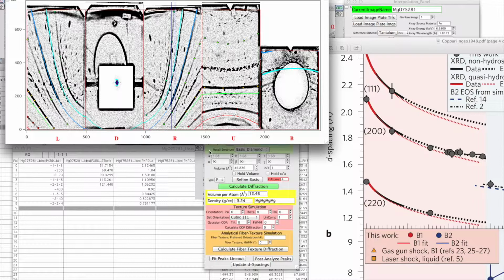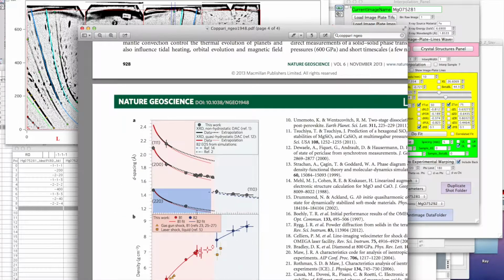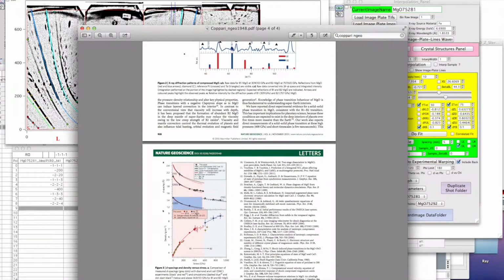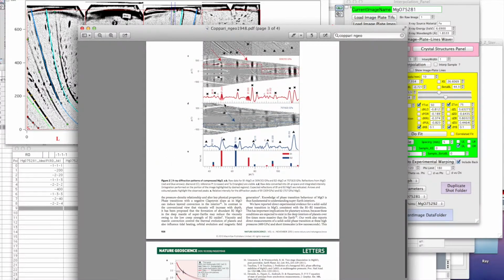So you should check the d-spacing of the 200. 200 is the most intense peak? Yeah. I know this is in your paper as well. I just want to have a look at it. B1 200. Okay, so that's the 200 peak, and so we should look at that.